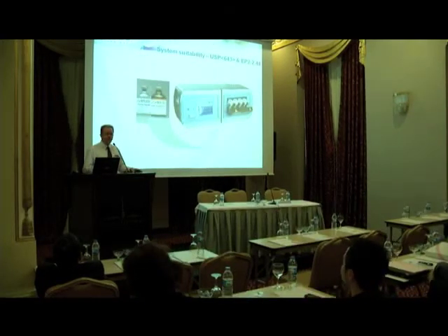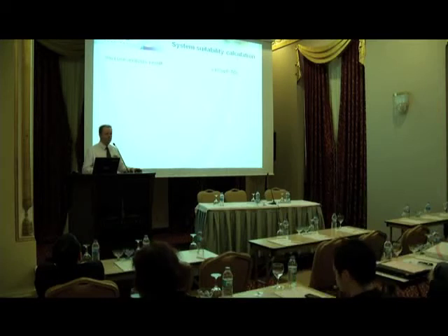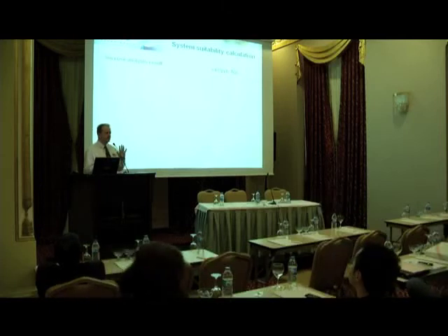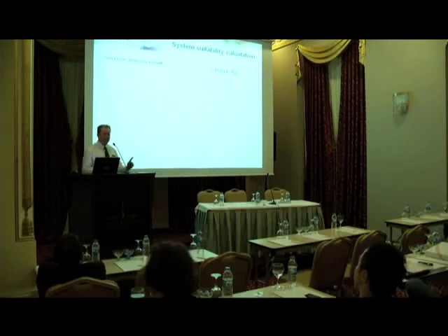So we put into the analyzer the sucrose and the benzoquinone. The analyzer does the test. First of all, it reports the sucrose, so we put in a 500 ppb standard. Now what's important here is that it has actually reported 475. It doesn't matter for system suitability. System suitability is not a calibration. So in many ways, the actual number that it reports is not important, and I'll explain that now.